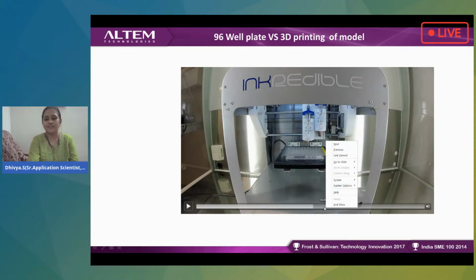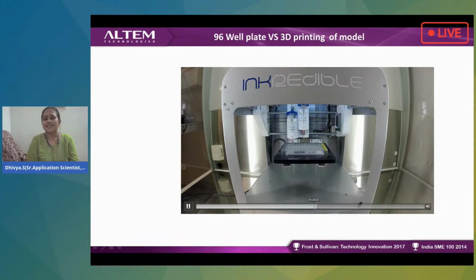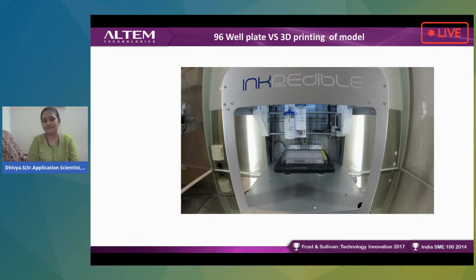So one by one, it will keep on spreading the cells. It will cover each and every well, and then print with the cells.